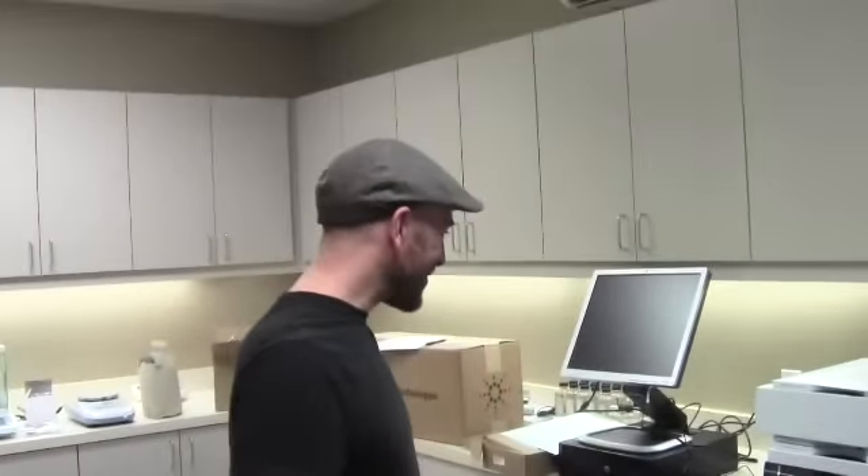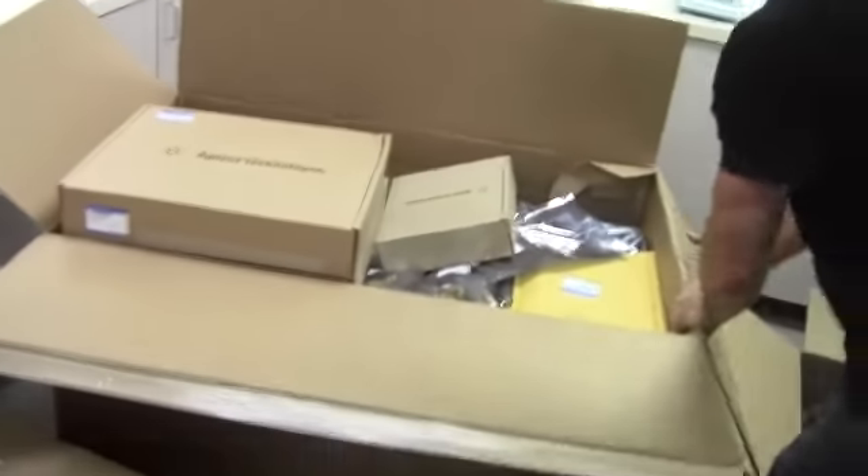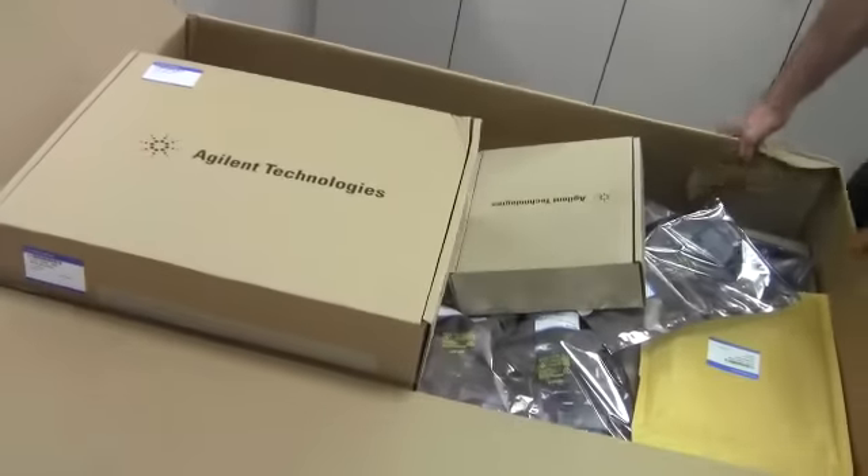Hey Johnny, so what do you have in here? Toys — HPLC and GC. And boxes and boxes and boxes. See, this box has lots of boxes in it. This is only going to take me about 40 days to put together, but when we're done we'll have lots of fantastic lab toys.